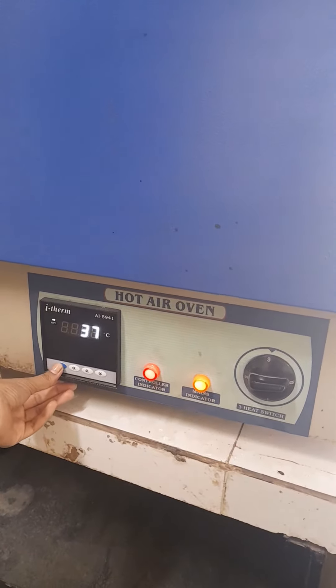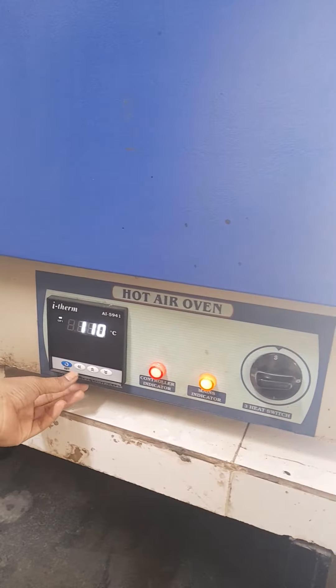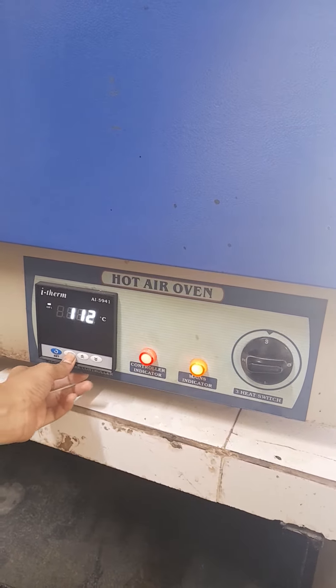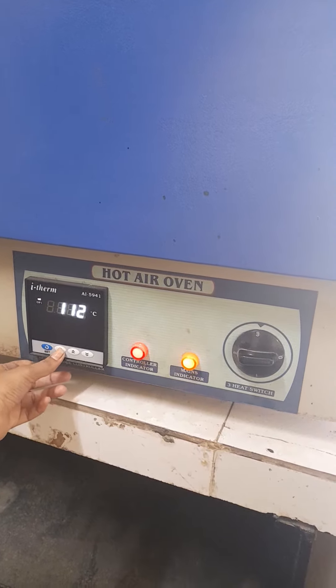We are demonstrating the hot air oven which is marketed by Lab Star Instruments. First, we switch on the power plug to get it started. We then set the temperature by pressing the knob.